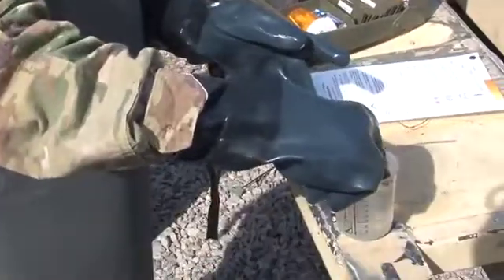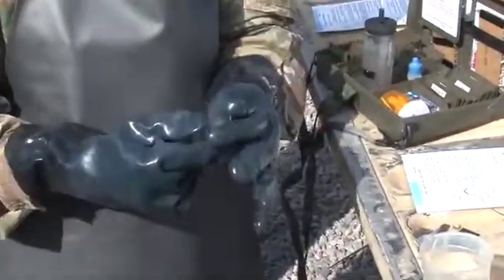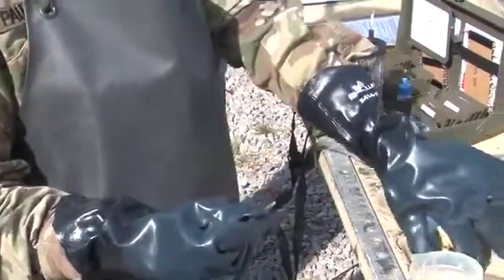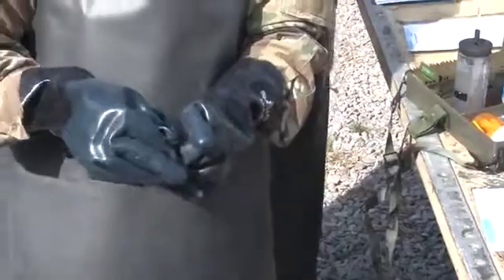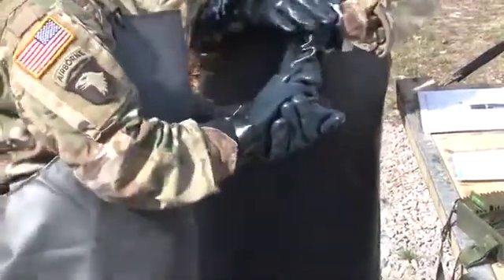Re-wet the white patch by submerging the white patch in the water. Fold the ticket at the fold mark and press the 2 patches together. Reinsert the folded ticket in the clip and hold it in your closed fist for another 3 minutes.